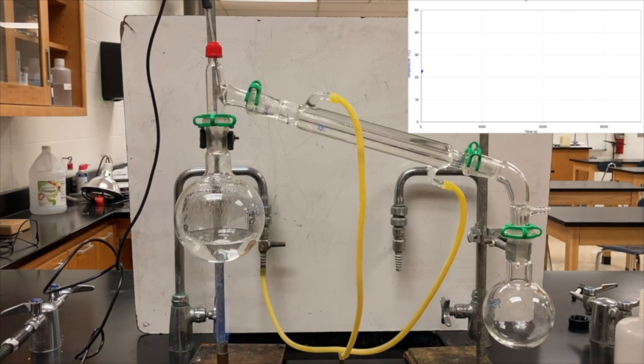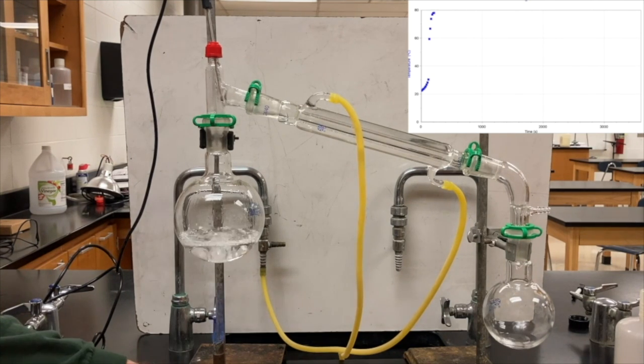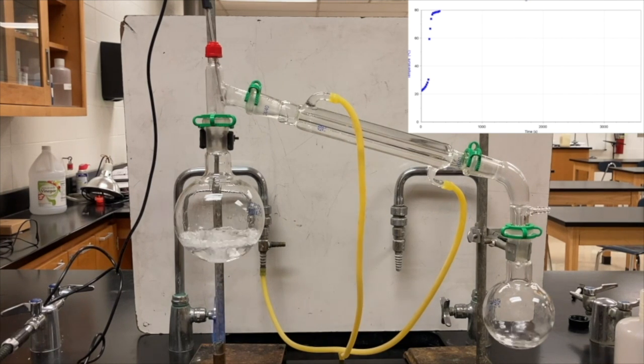And now I've moved the graph off to the corner, and we'll watch the distillation. Now this takes a while, and so it's going to be a lot of just watching water boil, basically, but I'm going to speed it up. You can see there's a rapid rise in temperature going on. This is boiling starting to take place.